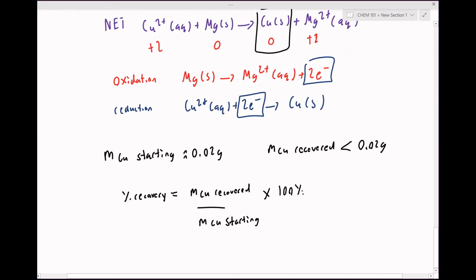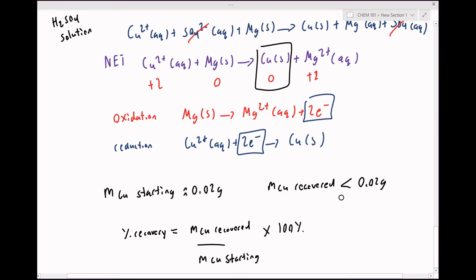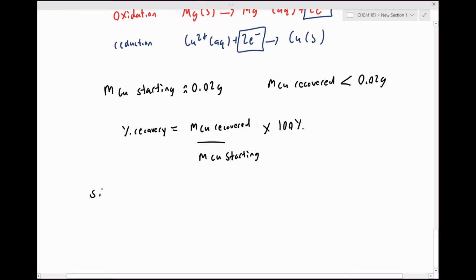So as you watch the video, I want you just to keep in mind that as you go through each of the reactions that we've outlined, I'd want you to focus intently on observing any color changes, trying to explain these color changes, and observing any potential side reactions that could be occurring and helping explain these side reactions. So just to help everyone along on this idea of side reactions and side processes.